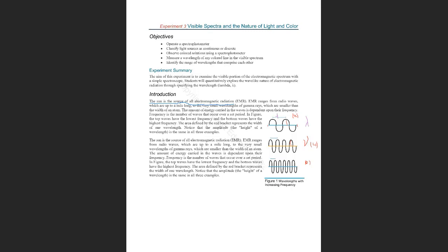The lowest one has the highest frequency and also has the lowest wavelength. So they are inversely proportional. One is higher, the other is lower. So in this graph, we see these different wavelengths with increasing frequency.